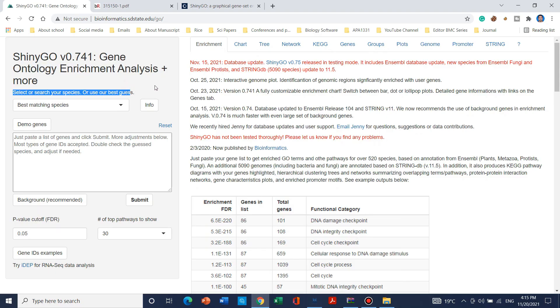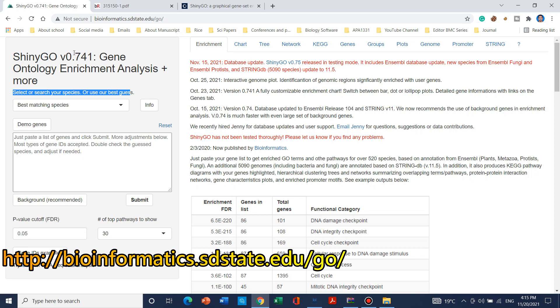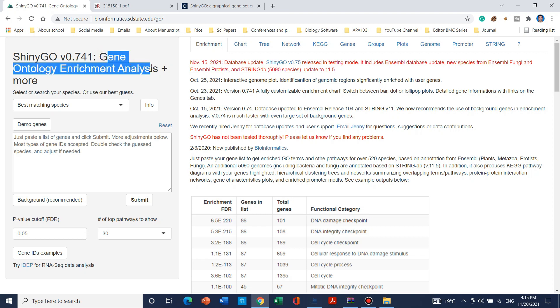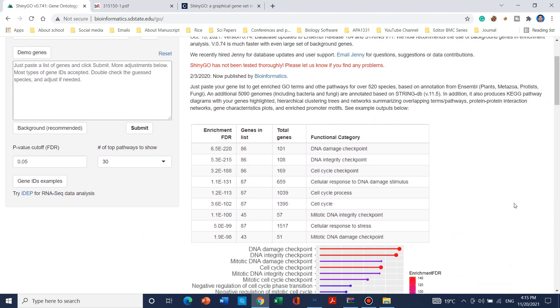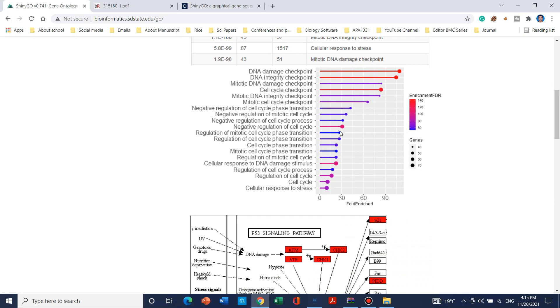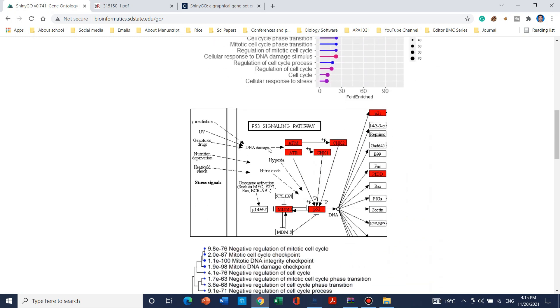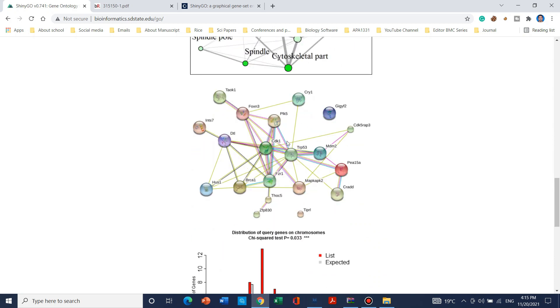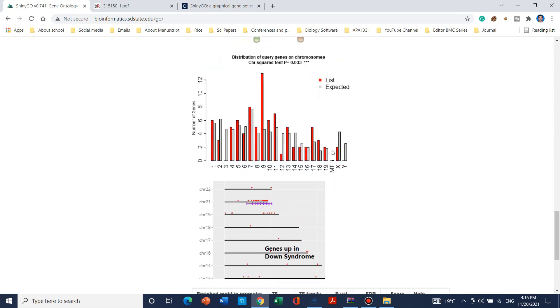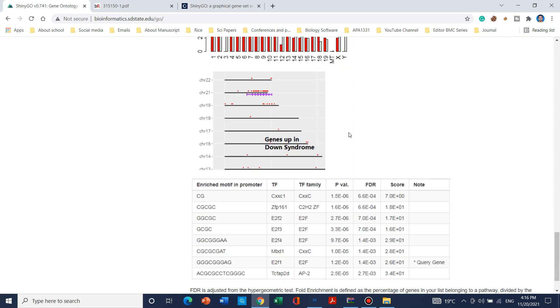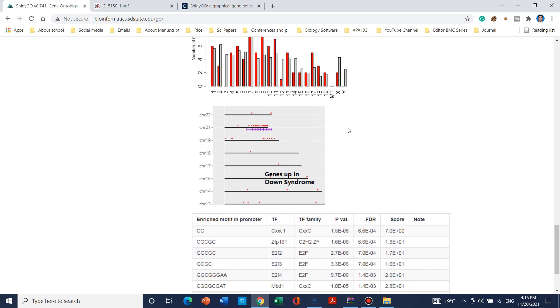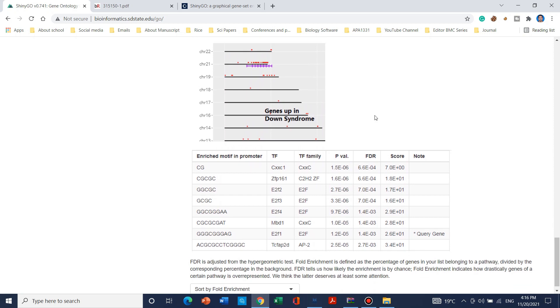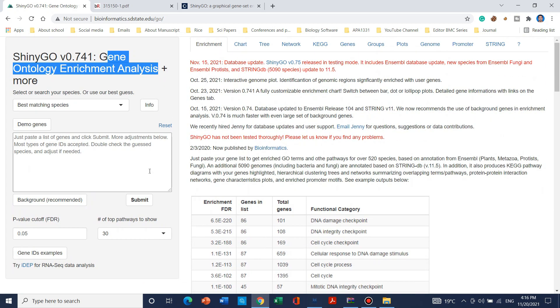Welcome to another video tutorial. In this video we will use an online tool called ShinyGO. ShinyGO is used for gene ontology enrichment analysis. With the help of this website you can create enrichment charts, signaling pathways for KEGG, develop tree networks with the combination of protein-protein interaction networks, and get information in tabular form for your promoter.